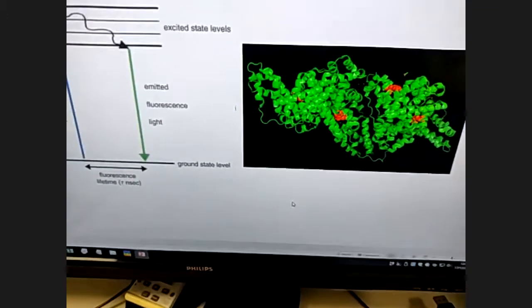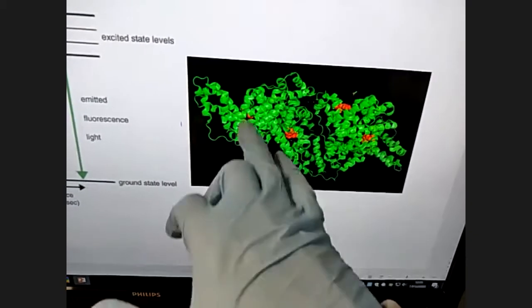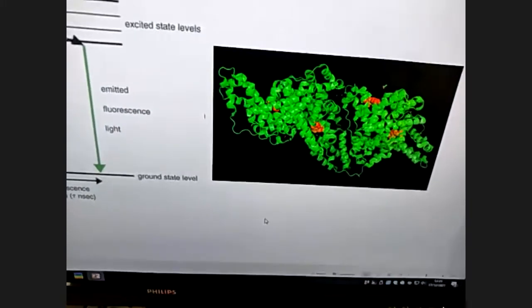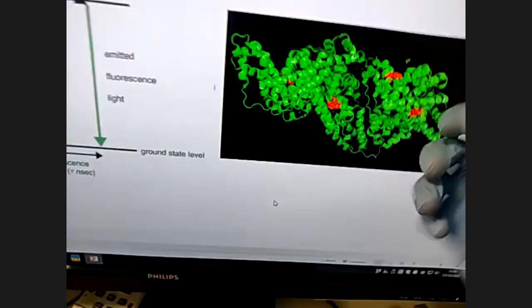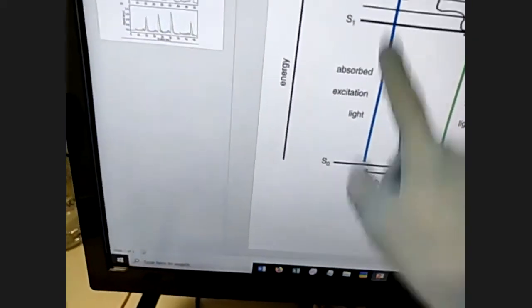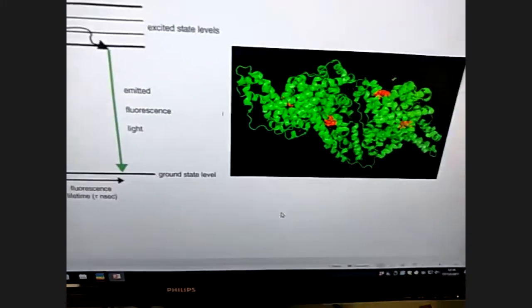In a protein, in this example, this is the structure of a test molecule, BSA, bovine serum albumin, and I've highlighted the tryptophan residues. The tryptophan residues can undergo this process of fluorescence. If you throw UV photons at tryptophan residues, they will emit bluish photons, and the state of the molecule, how denatured it is, how tightly the structure is bound, will change how that process works. What we'll be talking about later is the fluorescence lifetime, how long it takes to decay back to the ground state from an excited state by emission. How long that takes is dependent on the electrochemical structure surrounding each of these fluorescent residues.